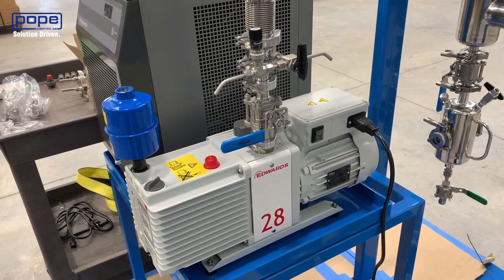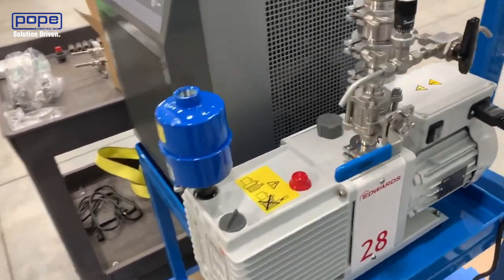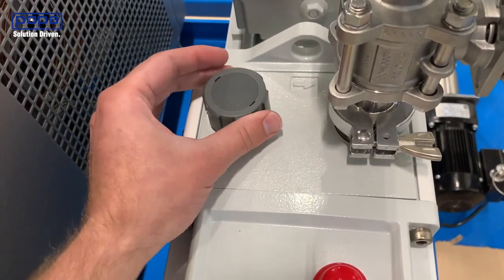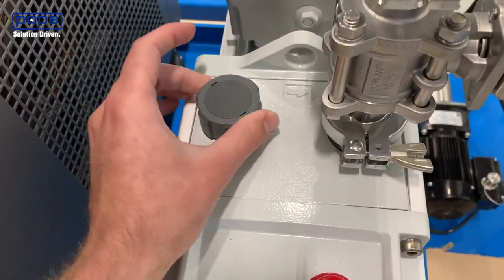For the larger Edwards vacuum pumps, you'll have a slightly different gas ballast design. In this design, it's not going to have a zero, one, and two — instead, you'll just take the gas ballast and twist it to the left to open and to the right to shut.